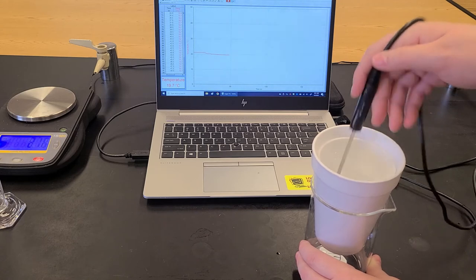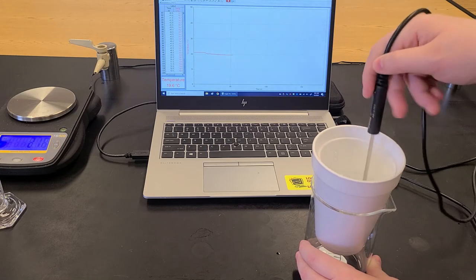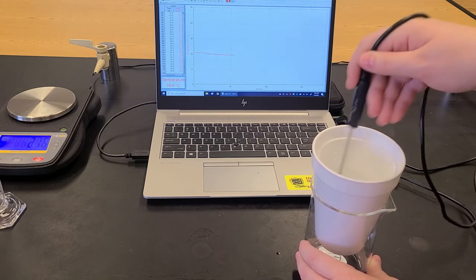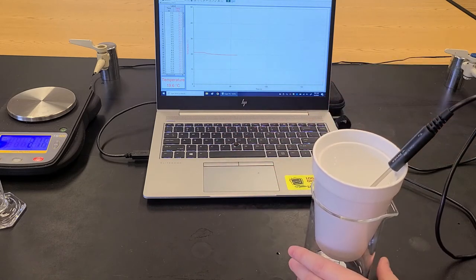So we would repeat this procedure here for each solid. There are six total. I am only showing you the one solid, but it's the same procedure where we need to determine what the temperature changes upon the addition to water.